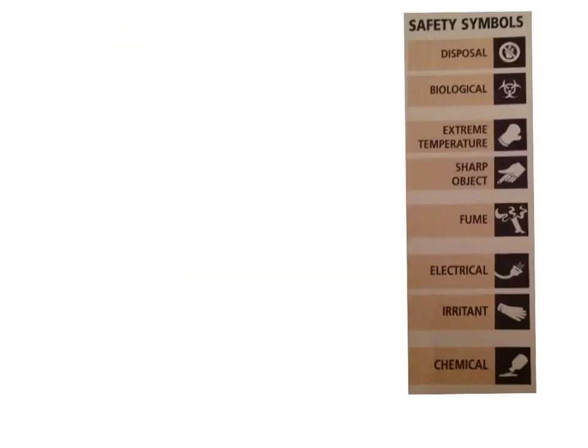Lab A. Now in your book, on one of the very first pages, or before we get to the title page, you're going to have a page that lists all of the safety symbols that we need to know about. And so we're going to talk about them here quickly, point out which ones are especially important for us and that you're going to run across this year. And these are the symbols that we're going to be using in class on Wednesday when we play our game.